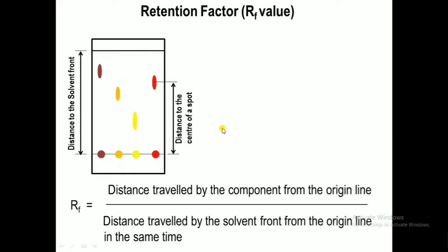For example, if you conduct this thin layer chromatography, this red spot will travel the same distance if you keep all the experimental conditions the same. So that is characteristic of a compound, and that will help you to identify the components in your mixture. So RF value is very important.